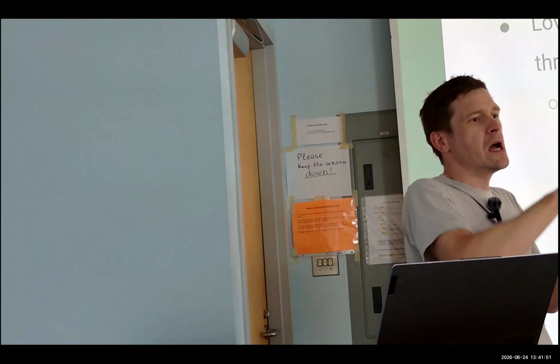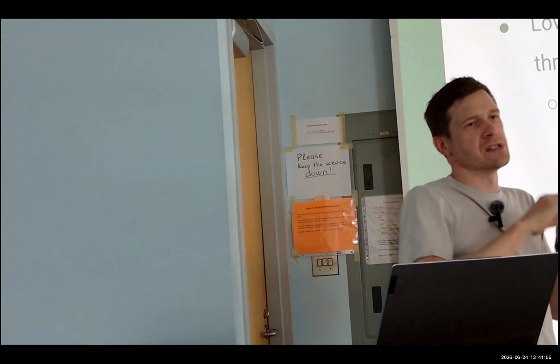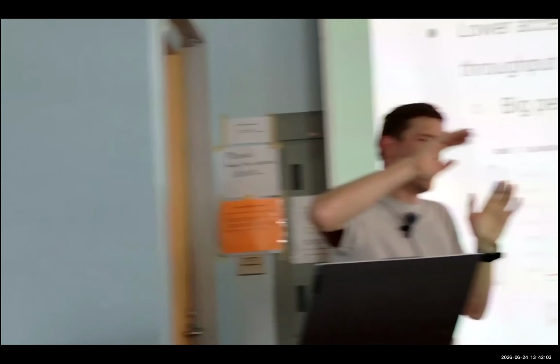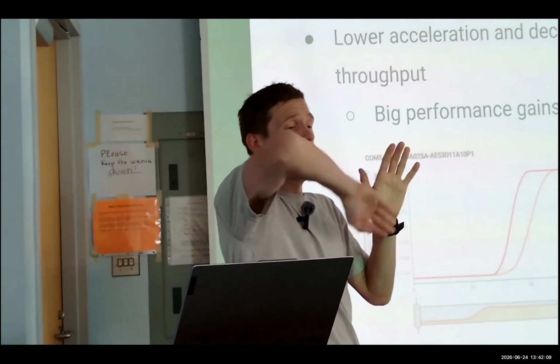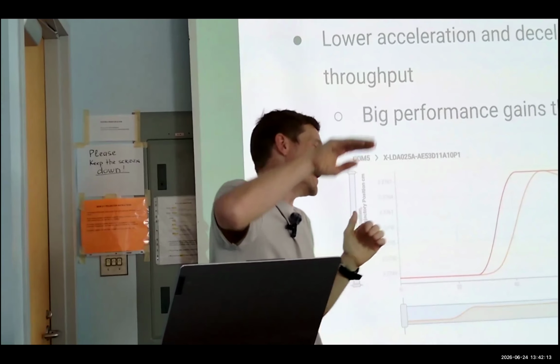In our focus stage, we've got a 1 nanometer interpolated optical resolution encoder. So you can get real-time position data from the stage, which is really useful in applying the input shaping to minimize the settling time. Ideally, you want your stage to basically reach the target position and just stop there.